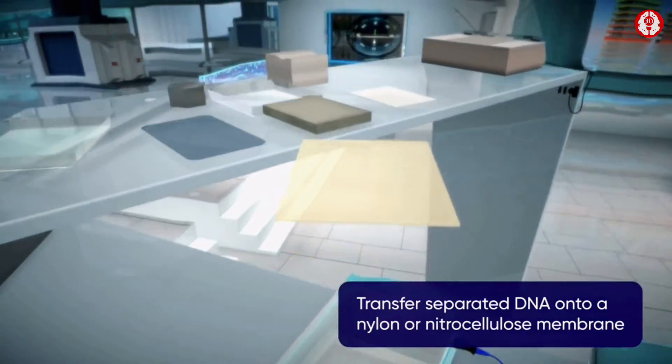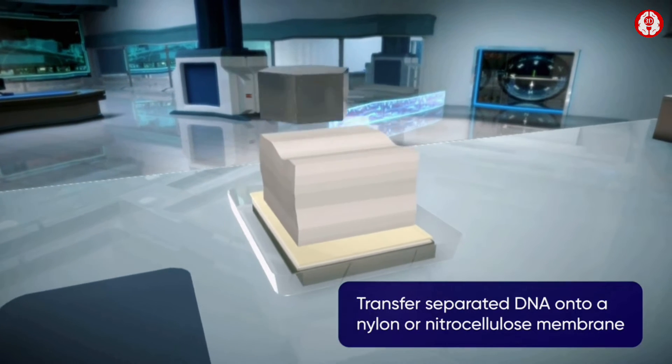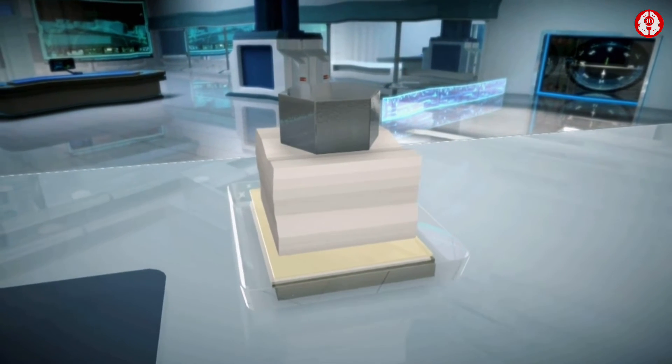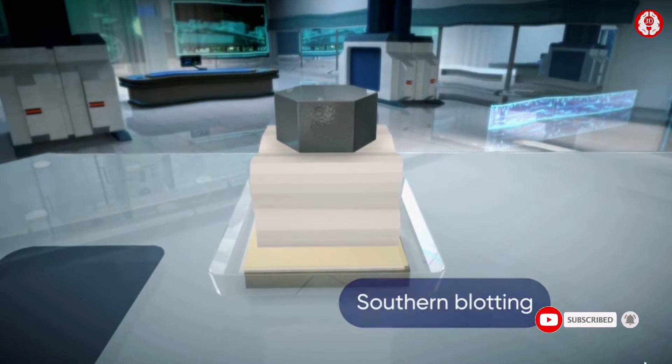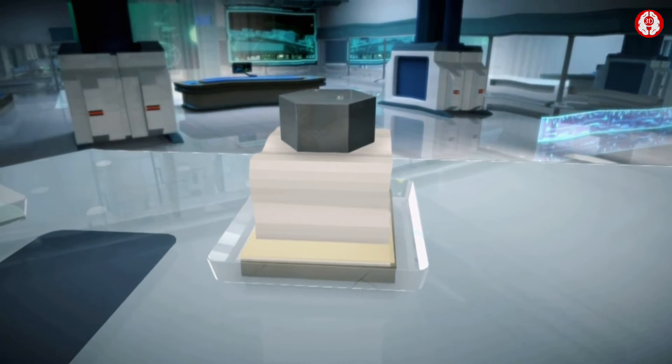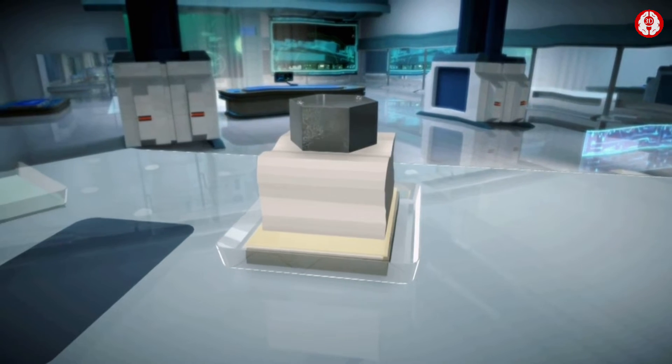DNA is then blotted onto a nylon or synthetic nitrocellulose membrane. This technique is known as Southern blotting. It reproduces the distribution of the DNA fragments on the gel.